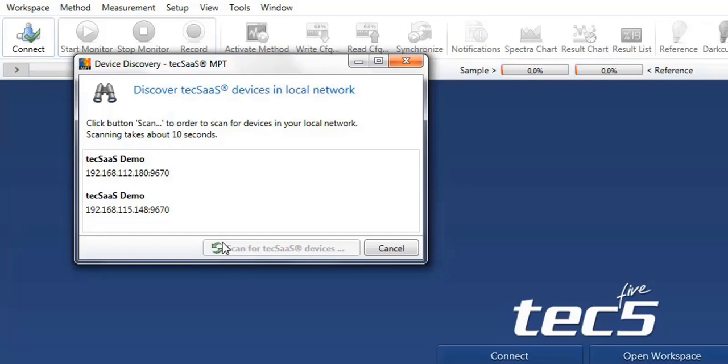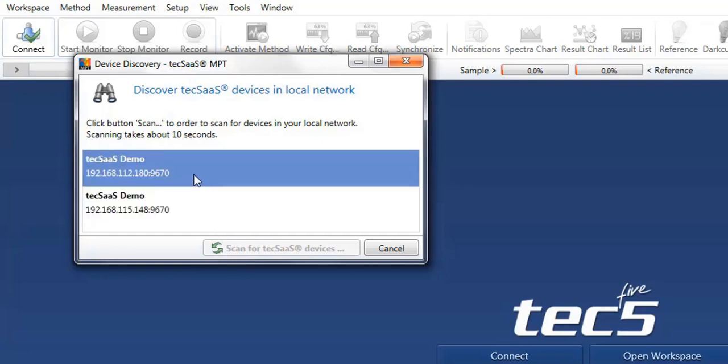In our case, the demo system with the IP address 180 and the port 9670 is selected upon a double-click.